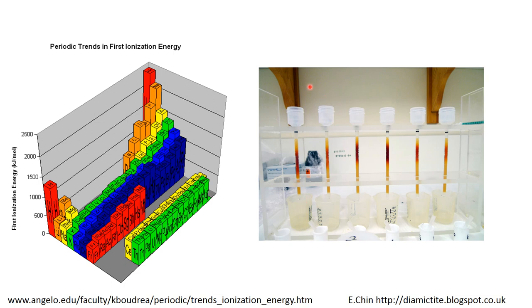So we get our sample, we dissolve up our rock, we put it in this kind of beaker at the top, and then as it flows down through this column, which is filled with effectively very expensive plastic sand, different elements fall out at the bottom at different times, or we add different acids to flush through different elements.